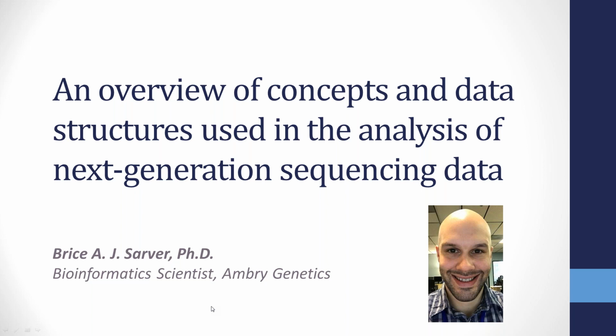What I'm going to be covering today is a pretty general overview of a variety of concepts and the data structures associated with them that are actually used in the analysis of next generation sequencing data, particularly with respect to calling variants that can be used in either a clinical or non-clinical research framework.